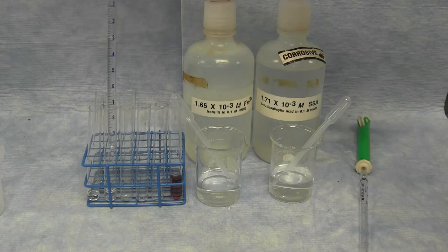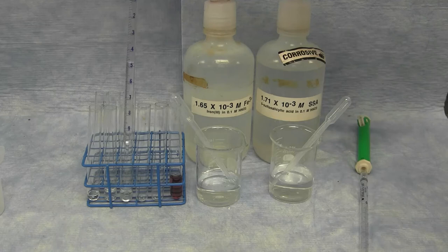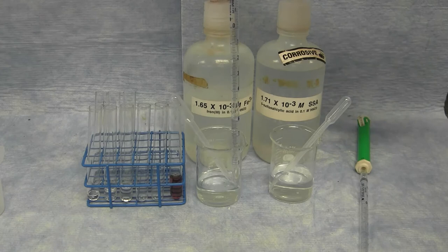Starting at the 3 mark to dispense 3 milliliters, I can dispense that all the way down to the 6.00 milliliter mark. And I can continue this method all the way through, stopping to refill my pipette when needed.